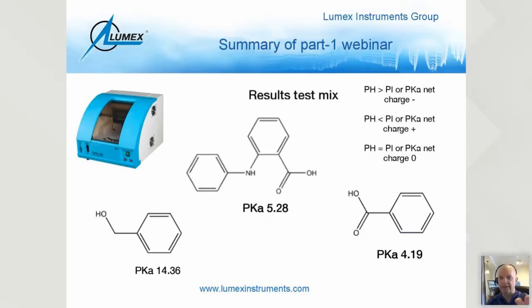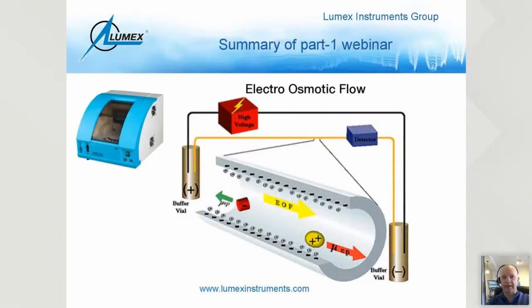So another piece of the puzzle. And then one big piece of a puzzle that I had presented to you was the electroosmotic flow. If you remember, I played a little video with a baby that was walking on an airport walkway and was being pushed away from her mom. Basically, that's what EOF does, it actually sweeps everything off of the capillary, and it'll sweep everything in this particular order. All positive charges will come out first, then the neutral charges, and after that, the negative charges. So keep that in mind.